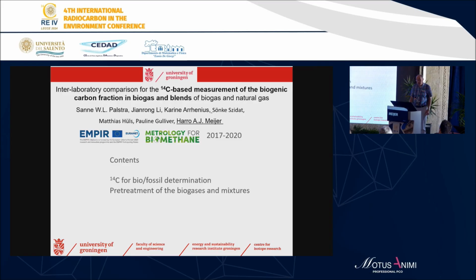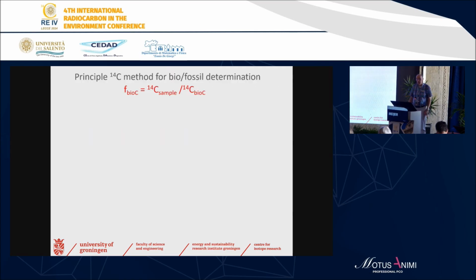I will show the pre-treatment of the biogases and the mixtures and how differences in that can make differences in your result. Show the results, of course, and then some conclusions and outlook. All right, the principle would be no real surprise here.